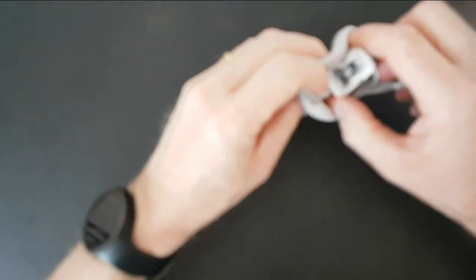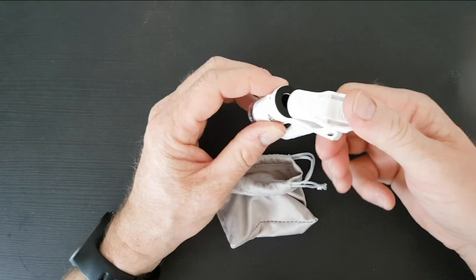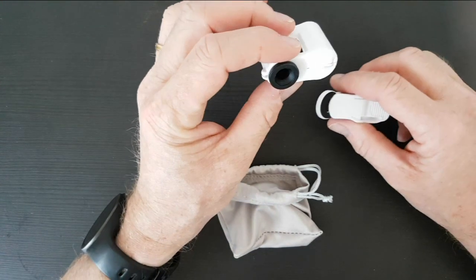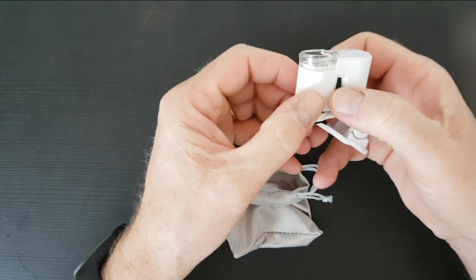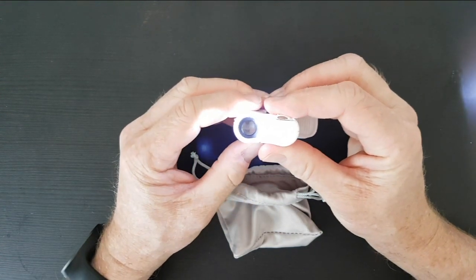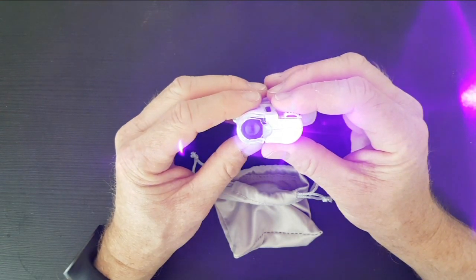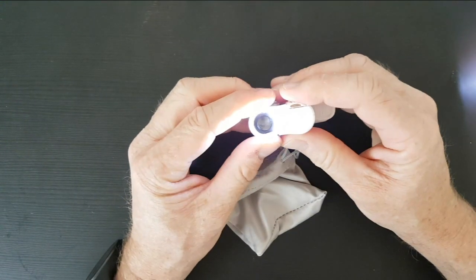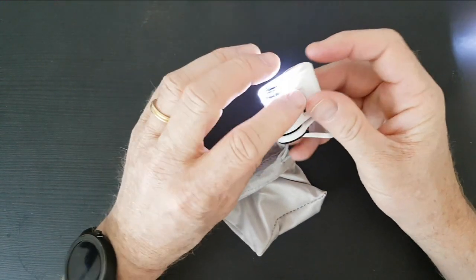The microscope comes in a protective bag. It's fitted on all phones I've tried it on — the clip is sturdy. If you choose not to use it on your phone, you can just attach it like that. It comes with a focus knob that seems to work. You can have the light on — this claims to be ultraviolet but it's definitely giving off at least violet because I can certainly see it. This piece of plastic acts as a diffuser to get light evenly spread around whatever you're illuminating.